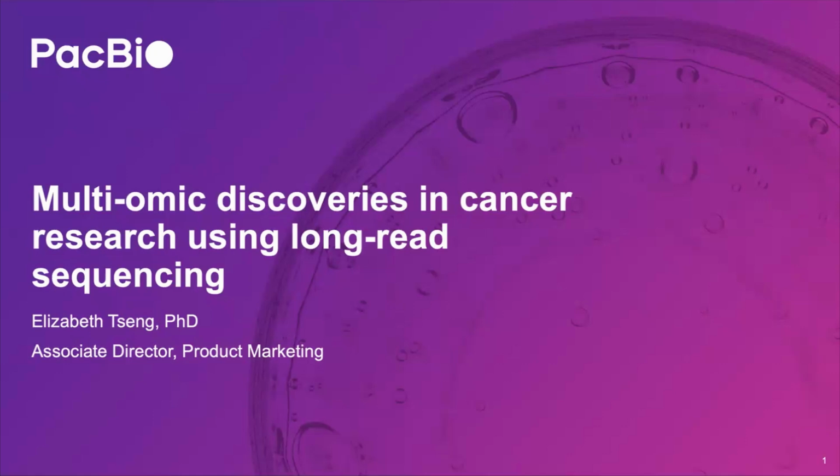Before we get to our guest speaker today, I'd like to give you an overview of how one can use multi-omic discoveries in cancer research with PacBio long-read sequencing.